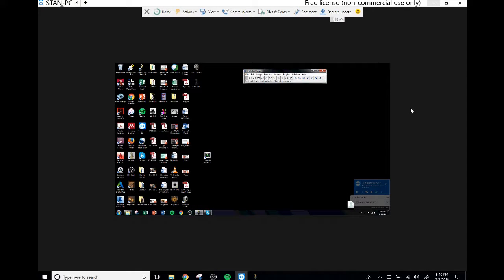Okay, so after a hard day at work, I realized that there is a way that I can still do this. The classifier didn't work. I let it run for like 8 hours and it still didn't finish. So what I'm doing now is I TeamViewed into my home PC and I'm running it there. I loaded up the file in there. Okay, and we're gonna go to a slice.